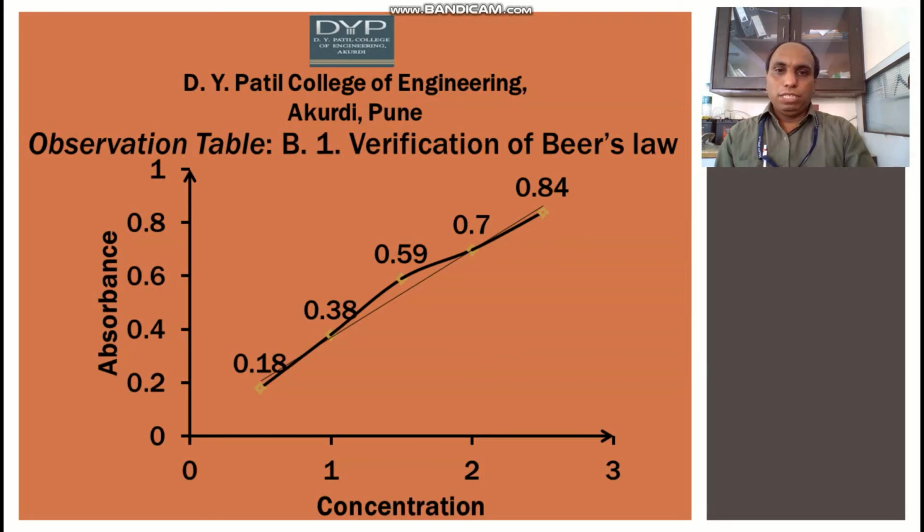You can see the straight line passes through the origin, and therefore as concentration increases, absorbance also increases. So from the graph we can say Beer's law is verified.